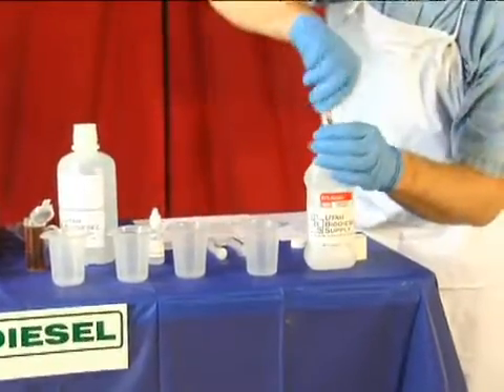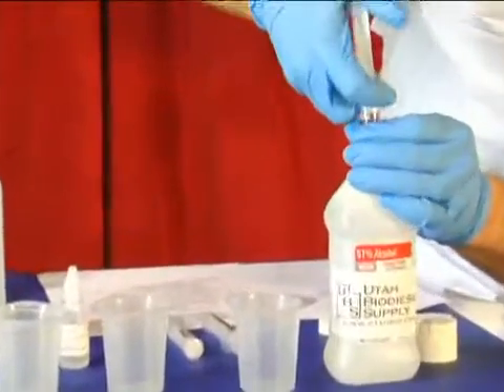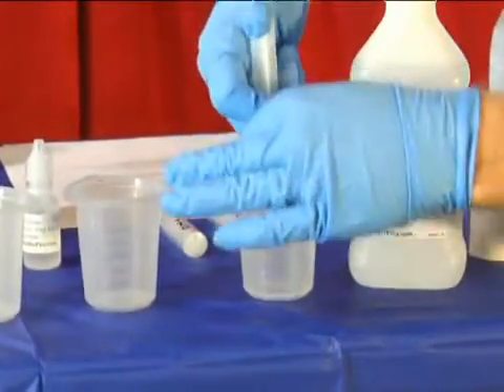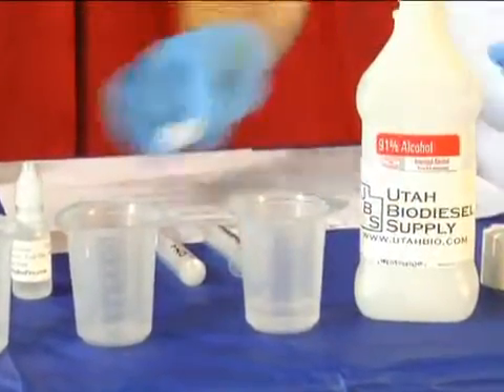First thing we do is we're going to go into the alcohol and we're going to pull up 10 milliliters of isopropyl alcohol. We're going to place that into a little dish, being careful not to splash it.